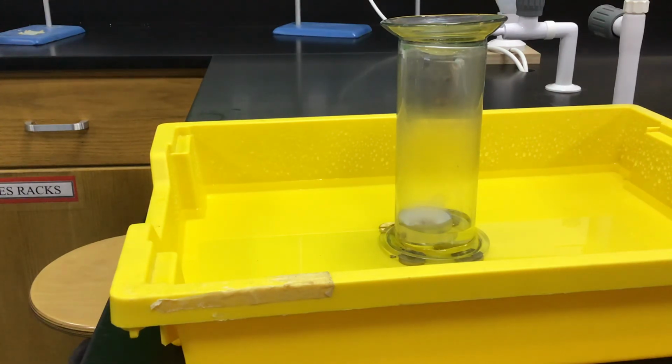Yeah, so that's a way of doing it, but we would use a slightly better setup that allows us to see or measure the amount that the tube goes up by. So have a think how you could practically set that up, but that's the basic idea.